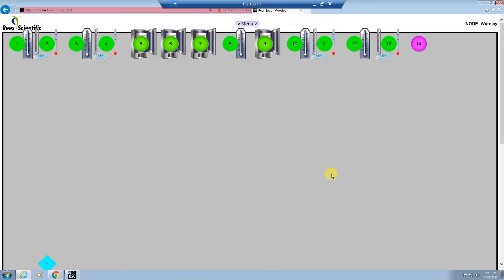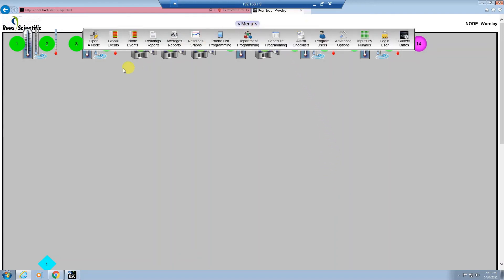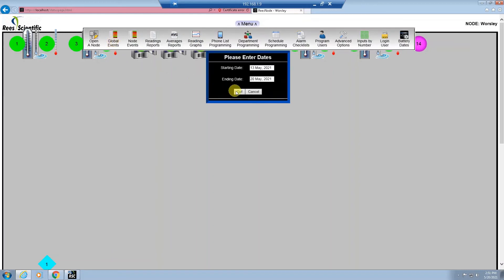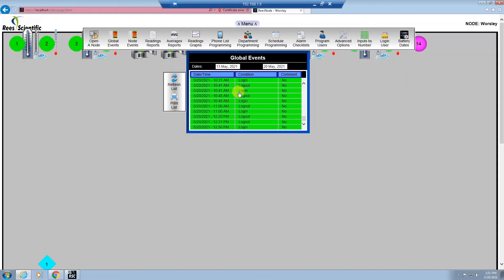To get the system reports, you need to select the menu button in the top center of the screen. To do global events, select the global events button, select your date range, and your report will show on your screen. To print this report, hit the print list icon and your report will then go into a separate window and you can hit Control+P or file print to print your report.